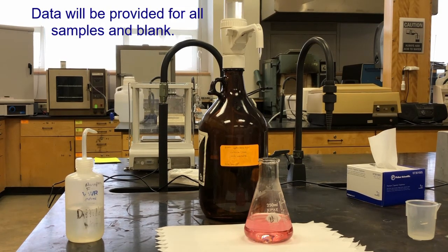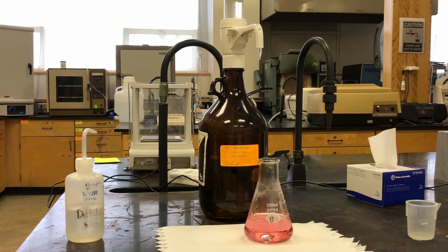So I'm going to run 2 more samples so we have triplicate results, as well as a blank, and that's the Kjeldahl nitrogen method.